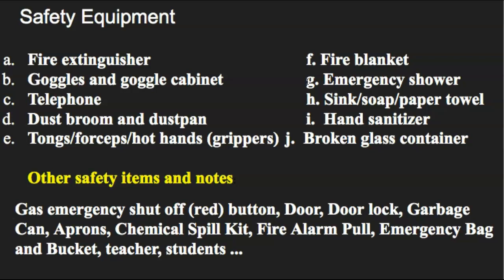And then also the school nurse, and eventually most likely 911 will be called, or somebody will take you to the doctor. The sink, the soap, the paper towel. Definitely a good idea to use that. Before you do labs, you should always wash your hands. And when you complete the lab, you should wash your hands.